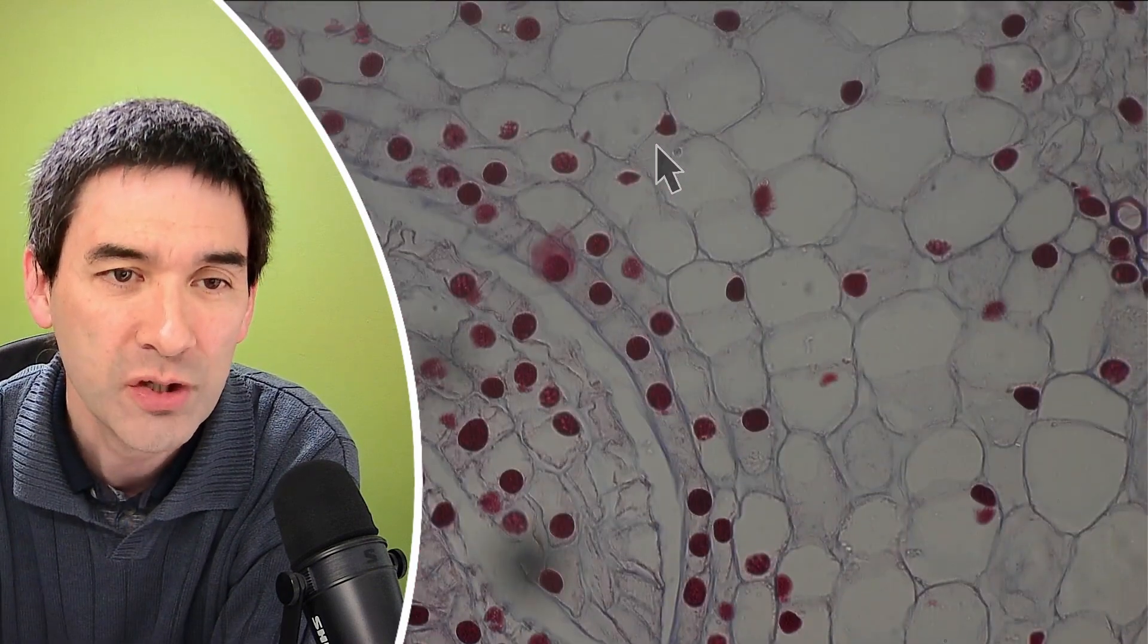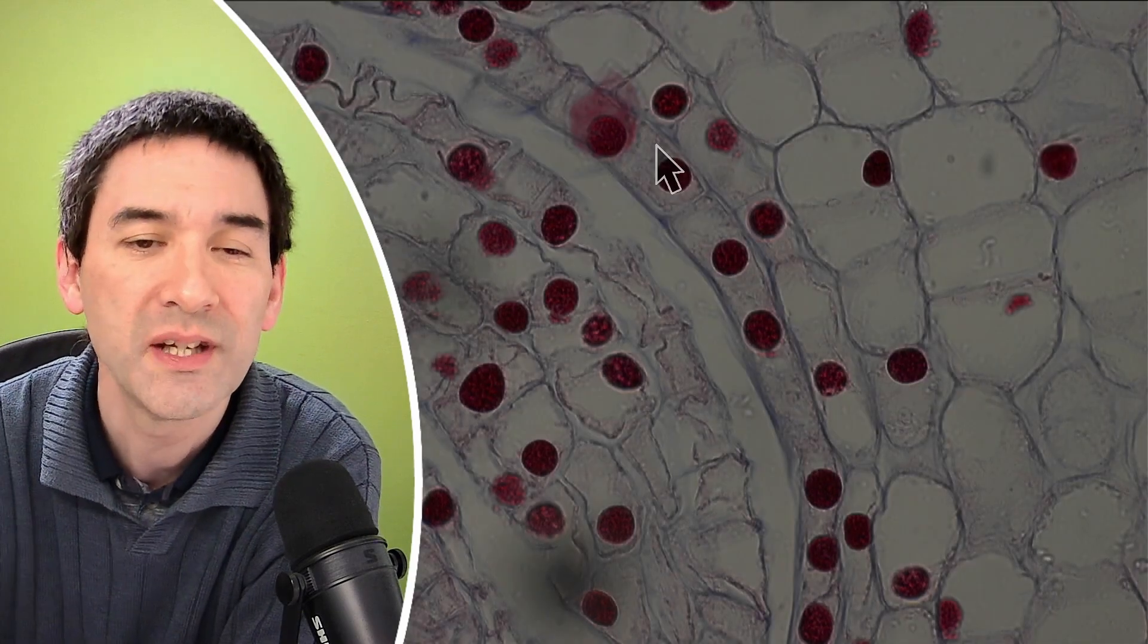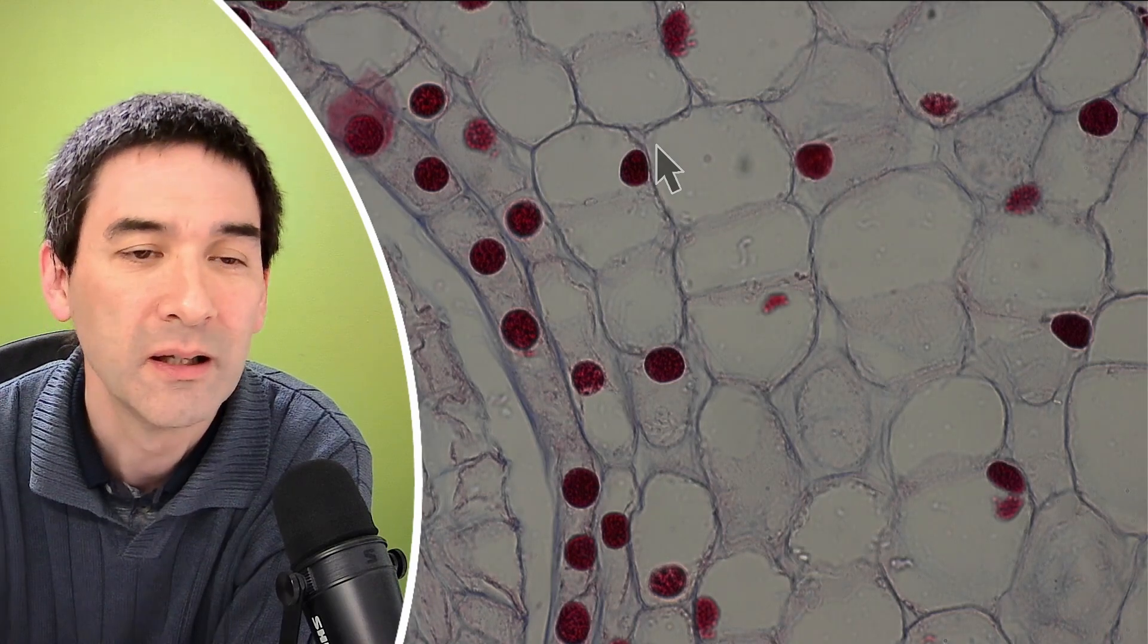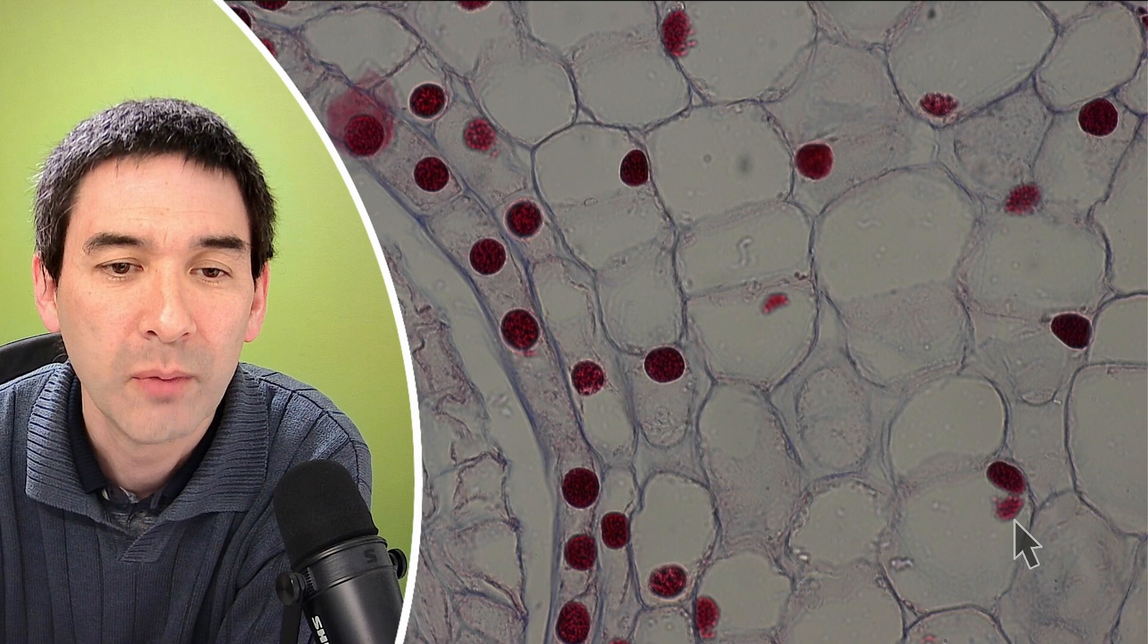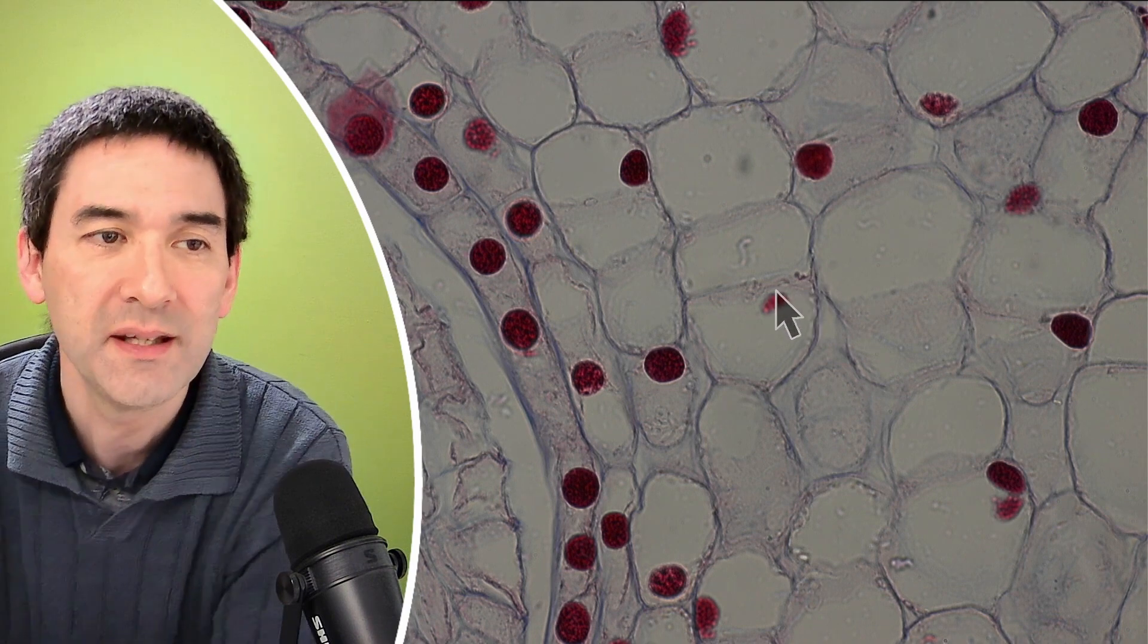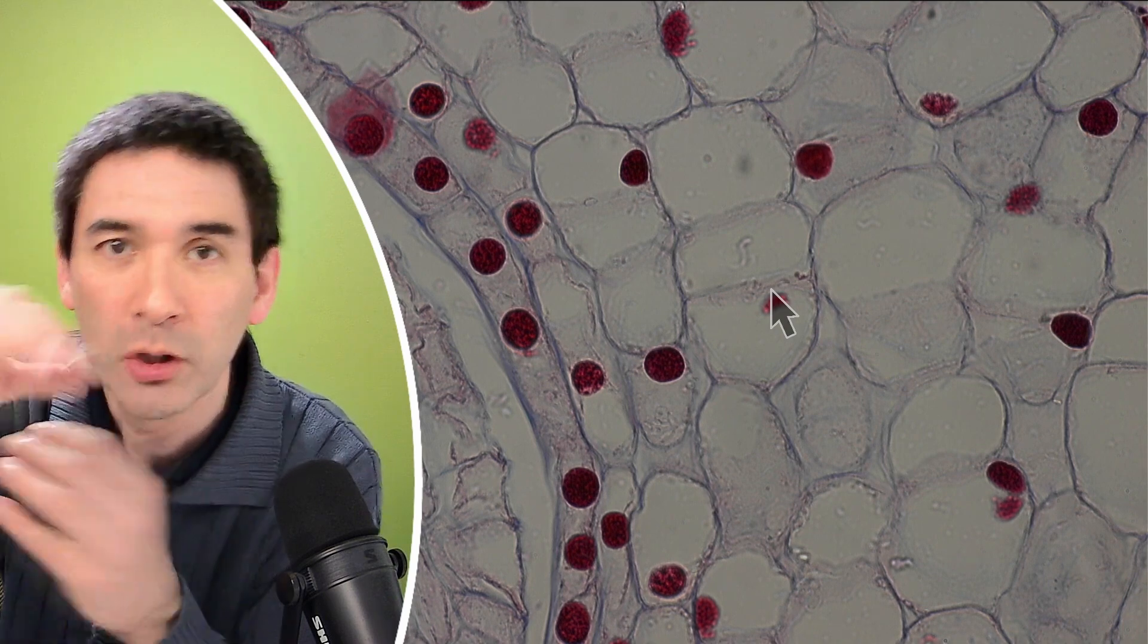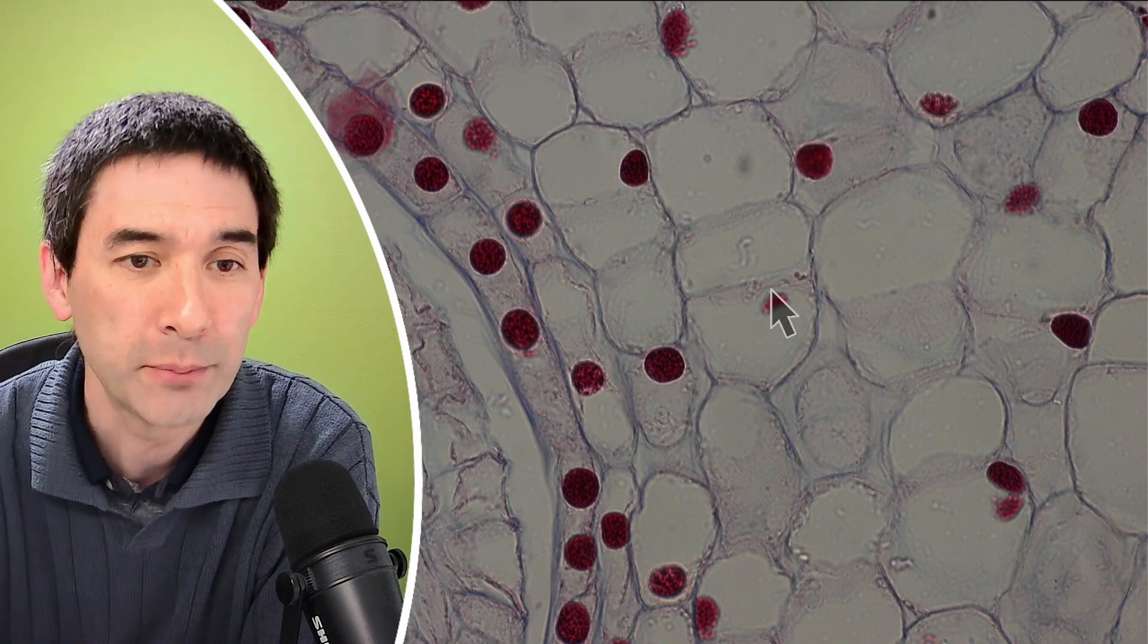And that's maybe also one of the reasons why some of the nuclei appear to be, like the one over here, appears to be a little bit smaller. And the reason is because the nucleus is also round. And now, if you kind of just cut it right at the top or at the bottom, where it kind of is round at the top a little bit, then, of course, it looks smaller. Because, again, here we see only a cross-section. But even here, we can actually zoom in a little bit more. So I'm going to go now all the way up to 60 times objective. And let's go up with light as well. You can see that this nucleus appears to be significantly smaller. Also, maybe this one over here. And this seems to be already the nucleus of another cell. So you see that, essentially, also the nucleus itself has a three-dimensional shape. And depending of where you cut it, it might appear smaller. But actually, you're kind of cutting away most of it. So that is, essentially, the question of a preparation artifact.